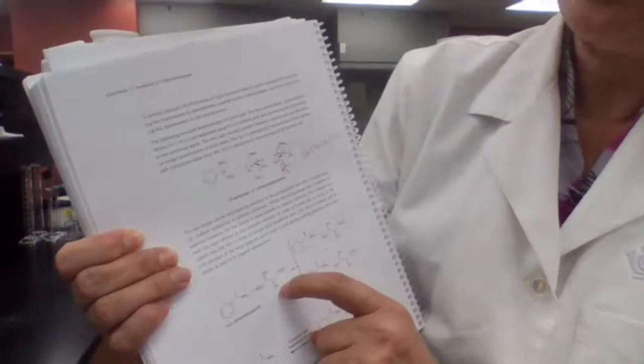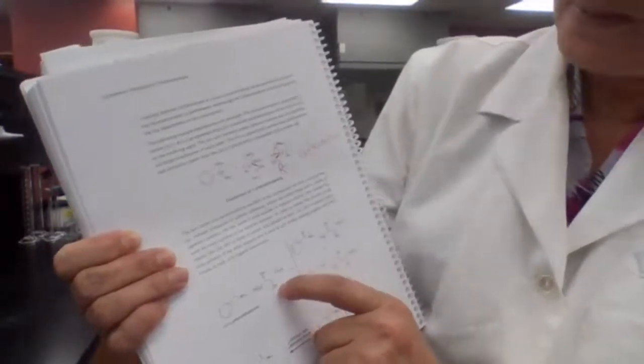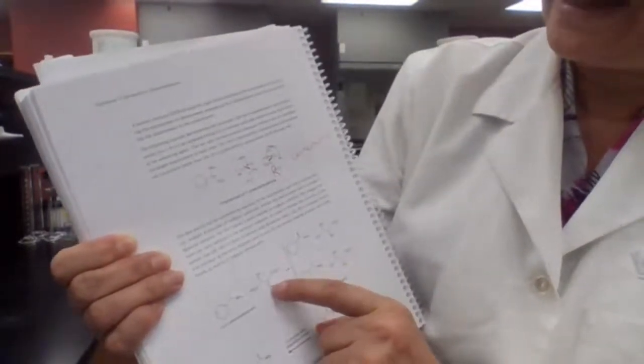The only difference between the two enantiomers is when you face them with a chiral compound, a pure chiral compound. So that's why we picked the tartaric acid, and the tartaric acid is pure R tartaric acid. It's going to react differently. It's like you have your right hand and you have your left hand.